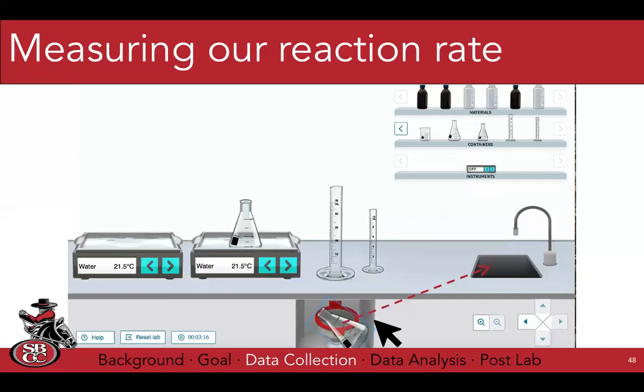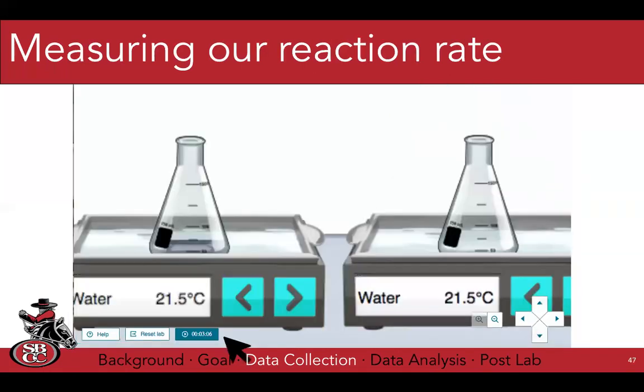Okay. And then when it flashes orange, that's when we measure the time. There's a second flash of orange that's very, very faint, and then it turns black. So either look for that flash of orange, or look for it to turn black or gray. I assume that the endpoint will vary within a few seconds for everybody, and that's very fine. It's not going to go from clear to black.